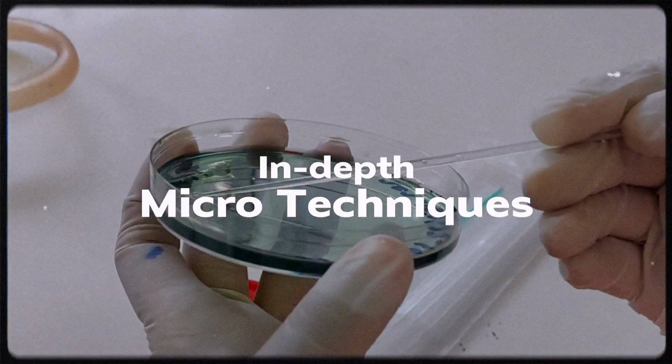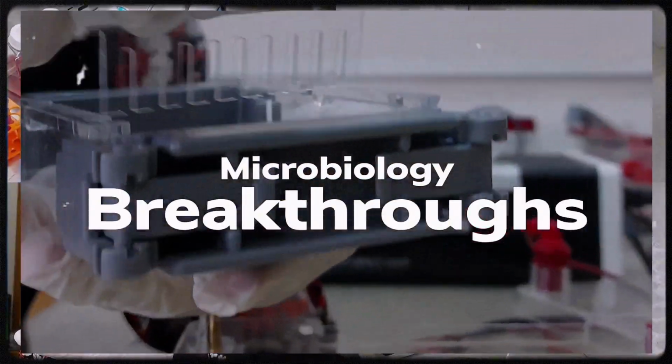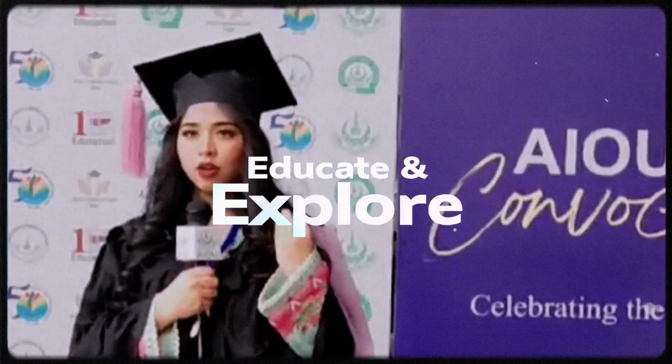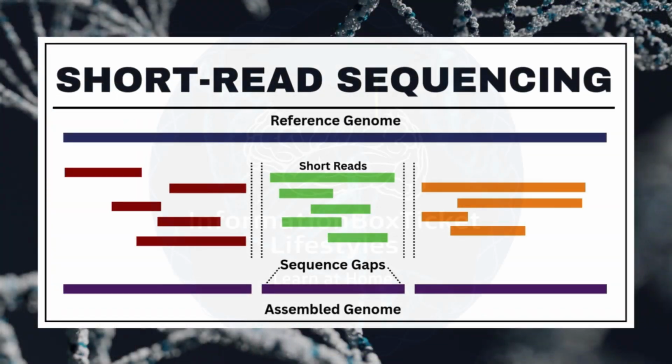Let's explore in-depth micro techniques and uncover groundbreaking insight together on this educational journey into the fascinating realms of microbes. Short read sequencing: principle, process, advantages, limitations, and applications.